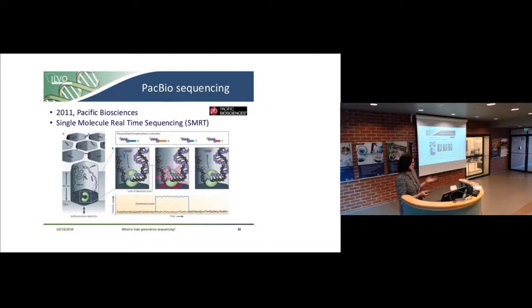It's easier if you can get a totally novel organism sequenced in longer pieces to make the map. And that is based on every molecule to be sequenced getting into these tiny nanowells, where the synthesis and the sequencing take place one molecule at a time.